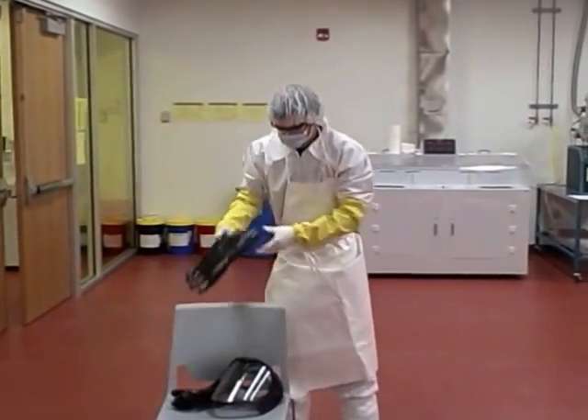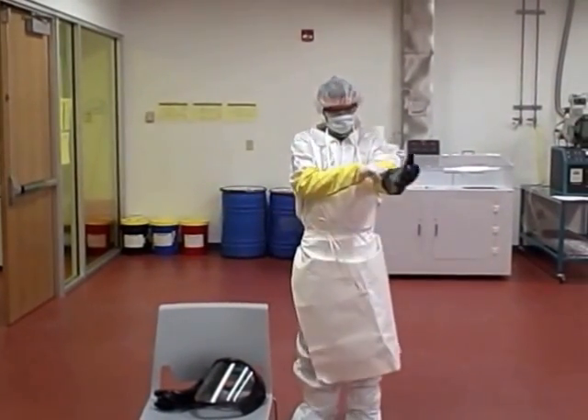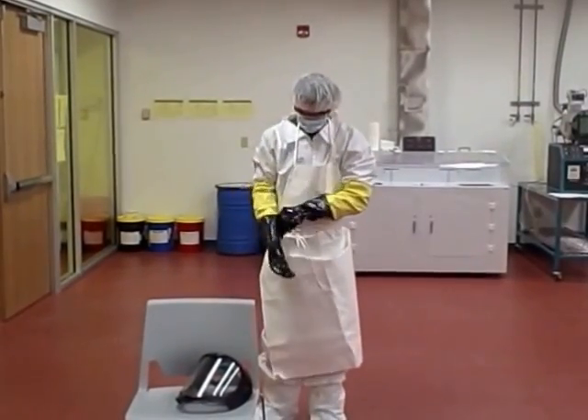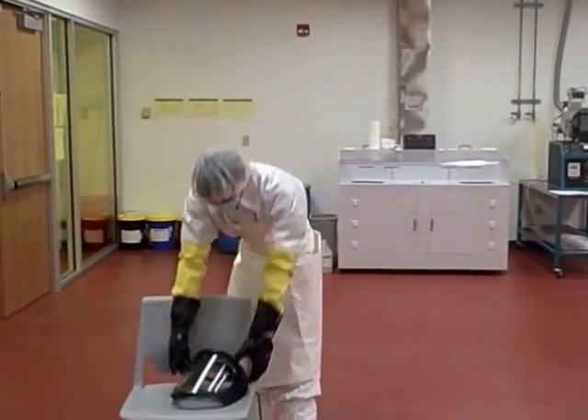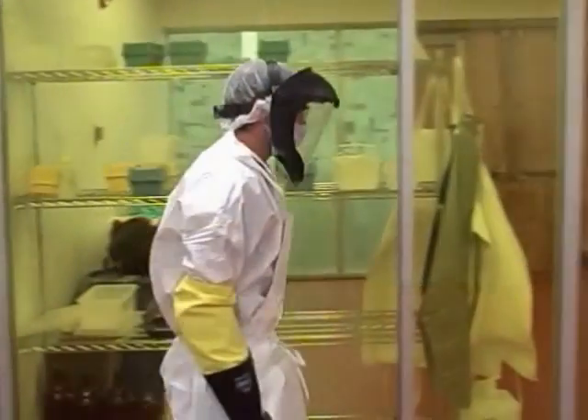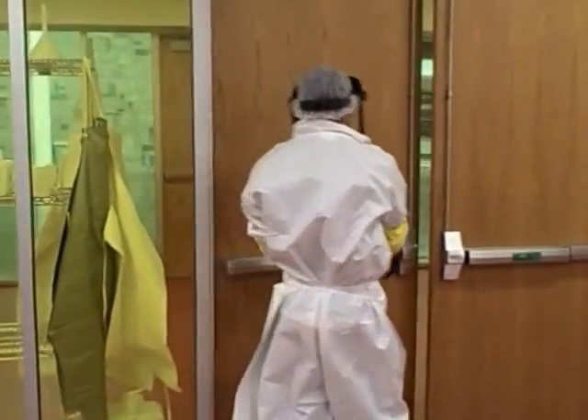Put on the chemical gloves over your original gloves and make sure the yellow sleeves are tucked in. Put on your face shield to protect against chemical splashes. You are now ready to enter the chemical room.